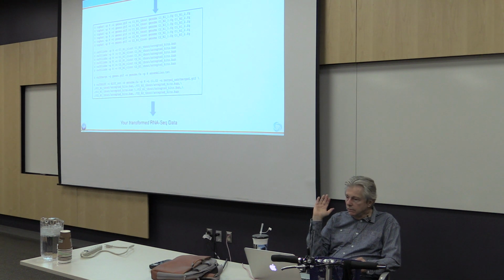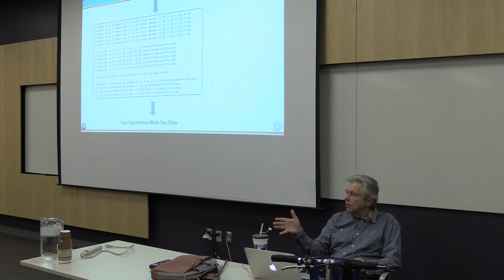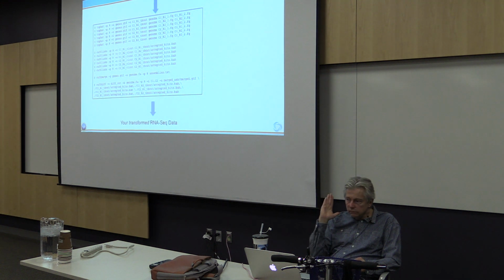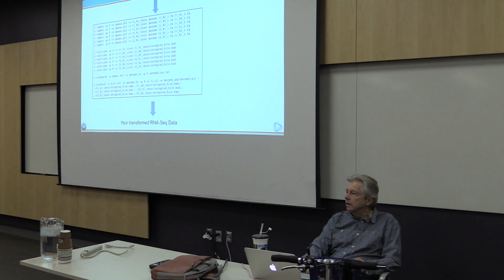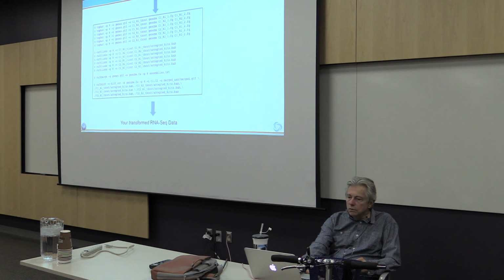And part of what the iPlant cyber infrastructure gives you is a place where everything is already installed, the applications are ready to run. If you have your data in there, it's ready to go. And it gives you a GUI interface, just drag and drop or click and browse, and you can start your application and do your analysis without much trouble.